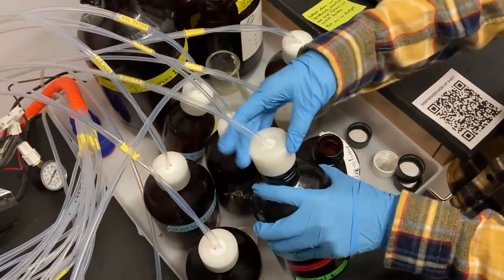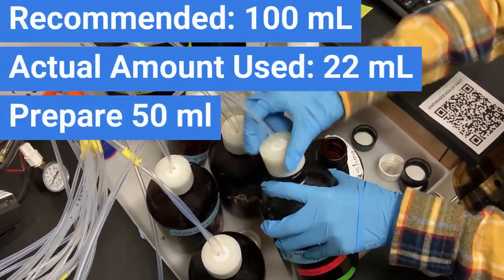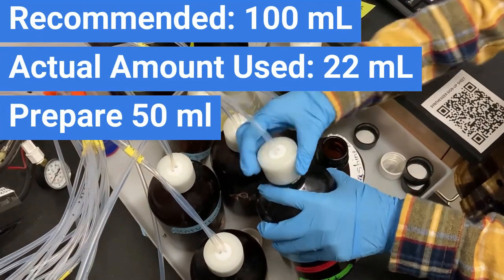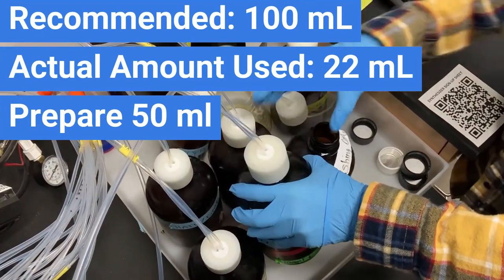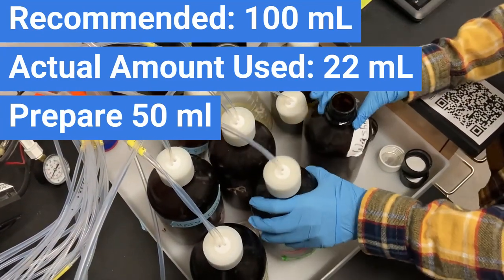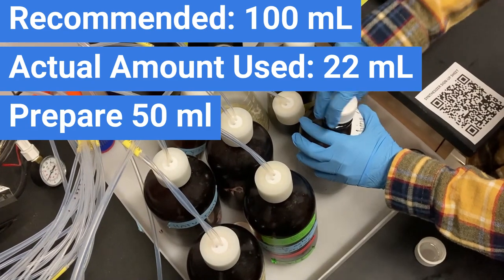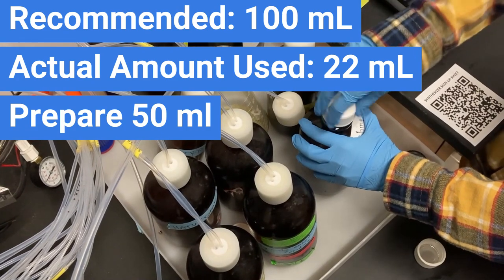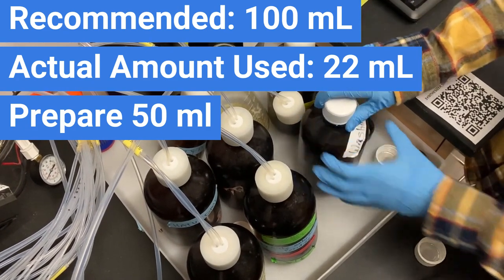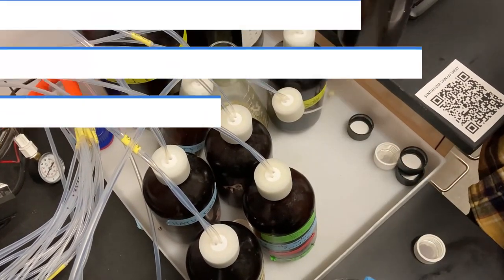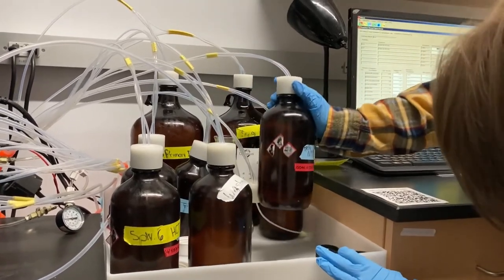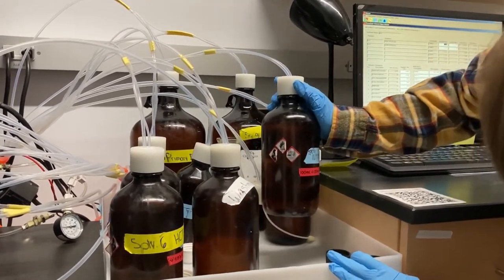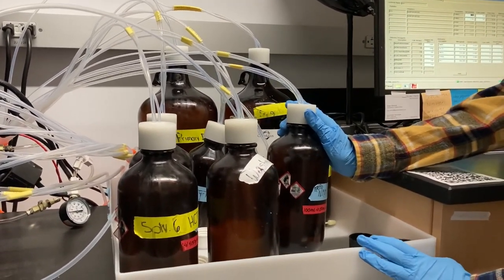While the instrument recommends that we have 100 ml of this solution in our reagent bottle, the synthesis needs only 22 ml. Therefore, it saves more reagents if we prepare 50 ml of the reagent instead of 100. Inspect each reagent bottle and determine which needs to be filled. Take note of how much reagent you need to make.